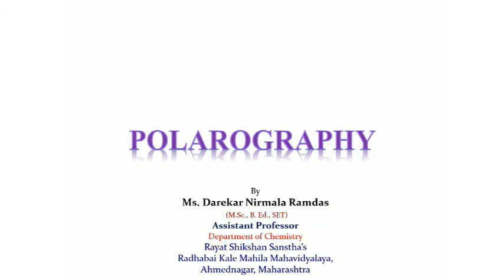Welcome to the second lecture of Polarography. In this lecture, we are going to study Polarographic cell, Polarograph, working of Polarograph and factors affecting measurement of current. Okay, let's start with our first point.